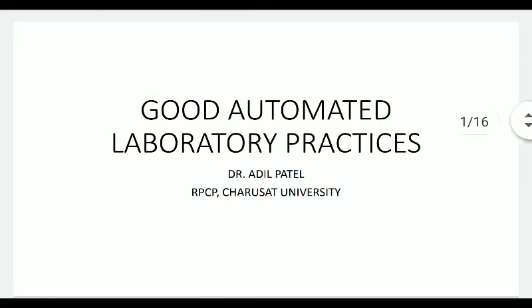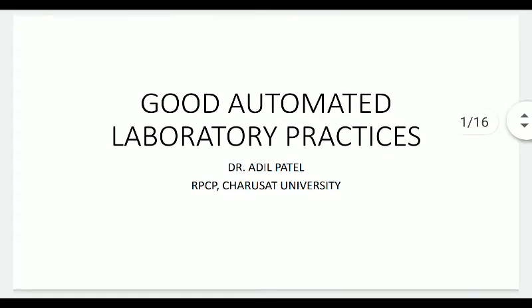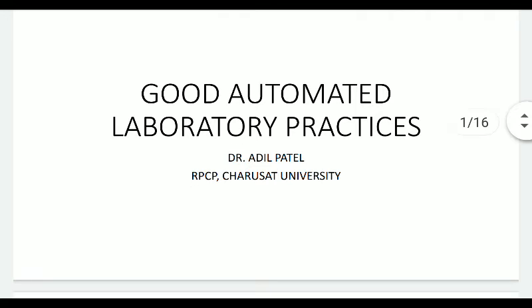Now at the onset I would like to clarify one thing: when we are discussing laboratory in our context, definitely we are talking about the pharmaceutical industry, but this particular guideline, that is good automated laboratory practices, can be applied to various other fields in which experimental data are taken in laboratory.